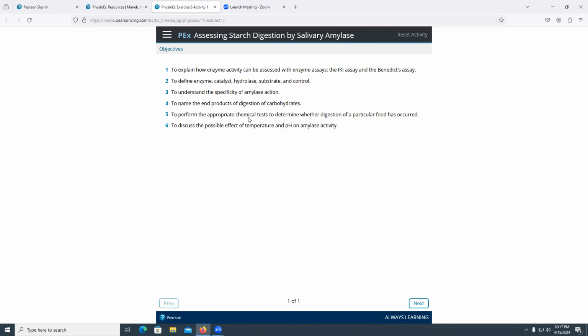And a control, we can have a positive control, that once I add the positive control into my reactant, I will have a known positive outcome. And if I add a negative control, I will have a negative response, meaning for example, if I have no sugar in my test tubes, that's a negative control because once I apply the marker, it will not change color. It will remain that same color. But if I have a known product, that would be an example of a positive control.